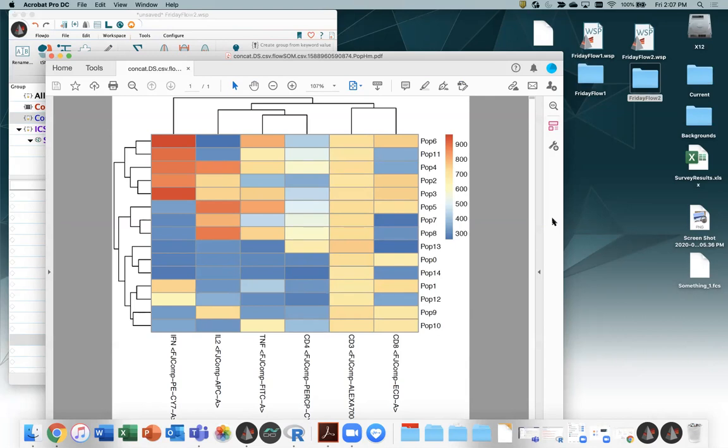Yes, awesome. So the most common issue there is that most of the dimension reduction tools have some kind of goodness metric that they're checking on in an iterative manner. And depending on how much control you have over your algorithm, you can stop too early. You can use one phase of the algorithm too long. A lot of people have pointed to the number of iterations in t-SNE particularly, and when the early exaggeration, or the first portion of the program, switches to the second, which is pushing apart dissimilar clusters. So the general answer is you should ask for better control of your tools.